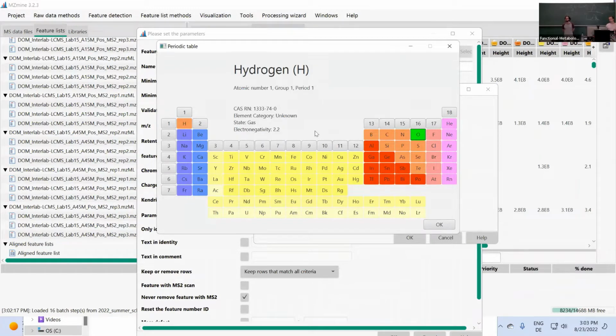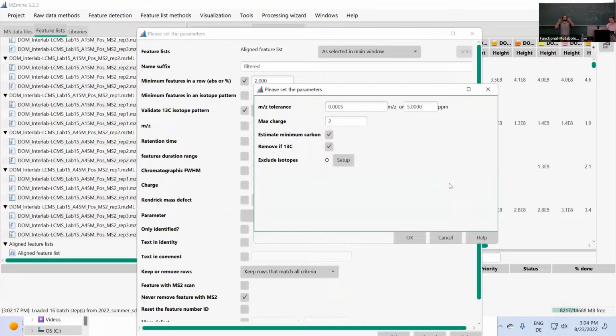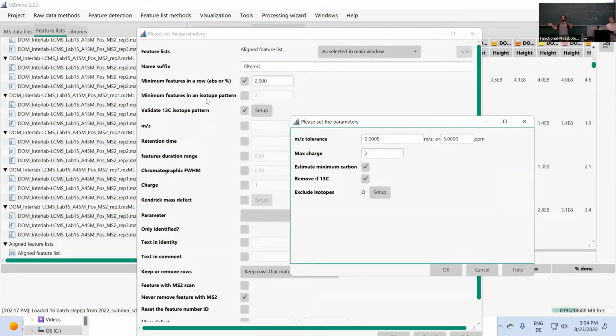It's just a different thing a bit. We had the 13C filter in the beginning, just to remove evident 13C features that are smaller, right? Then we did the isotope finder, being very open, searching for everything that might be an isotope pattern, maybe even some specific isotopes. But we didn't filter anything; the feature tables stay the same.